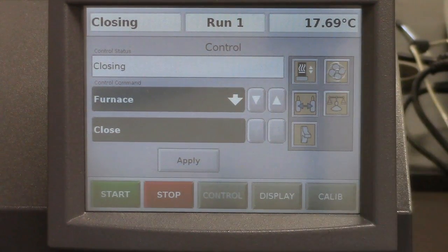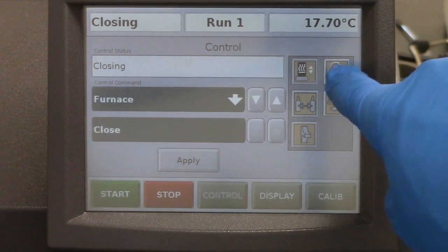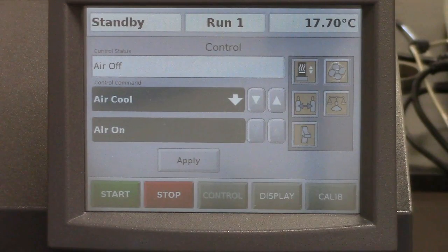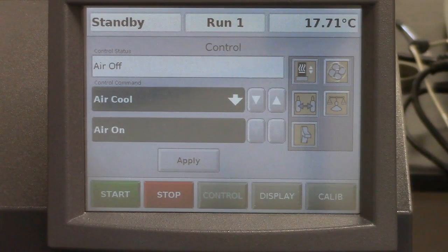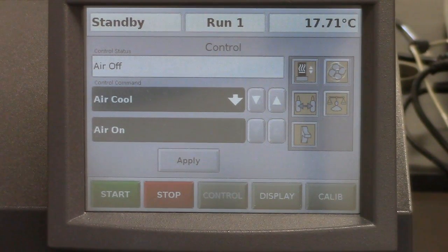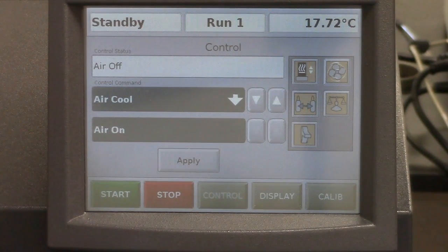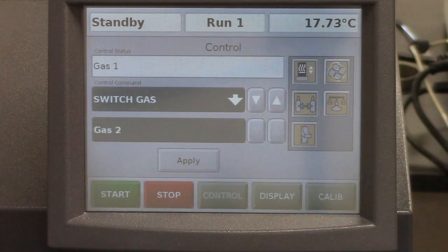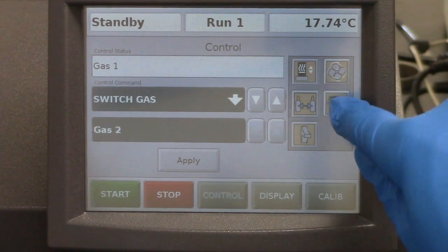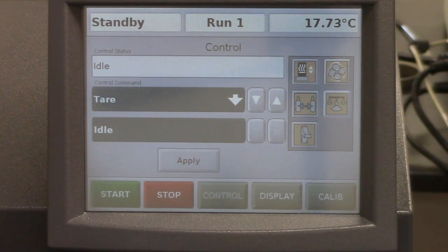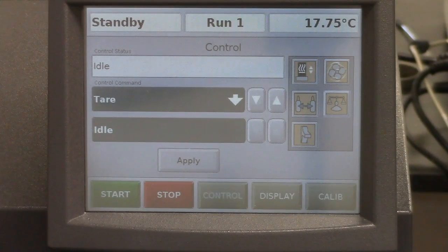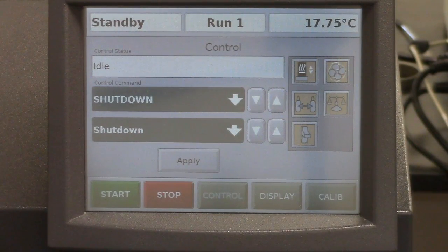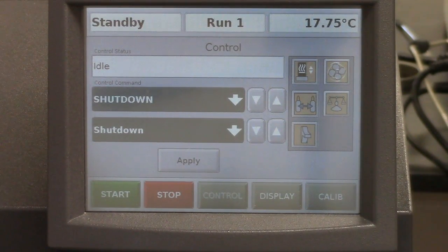There are several different options here on this menu. This one turns the air on or off, and we do want the air on after the TGA is done running to rapidly cool our sample. This one switches the gases. You don't need to mess with that. This one has to do with the balance. You also don't need to mess with that. And this is the shutdown switch when we're finished using the TGA.